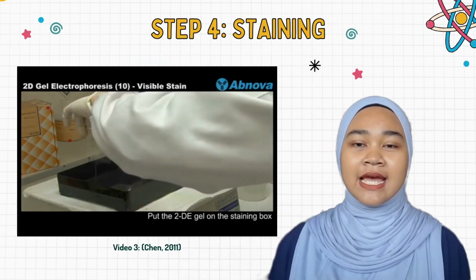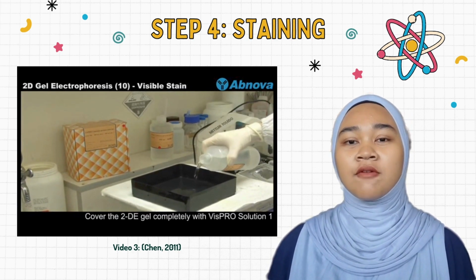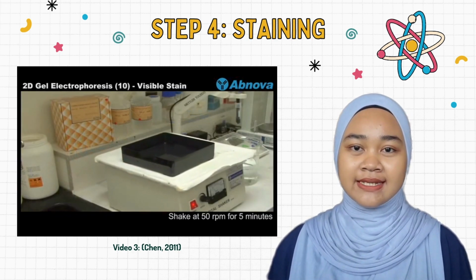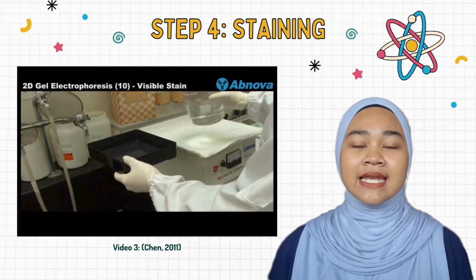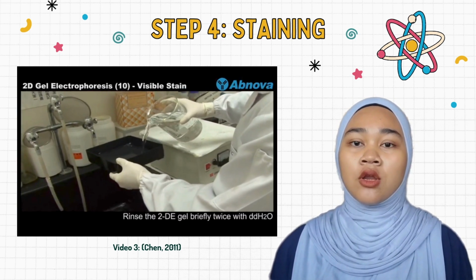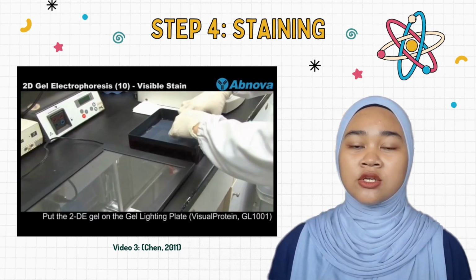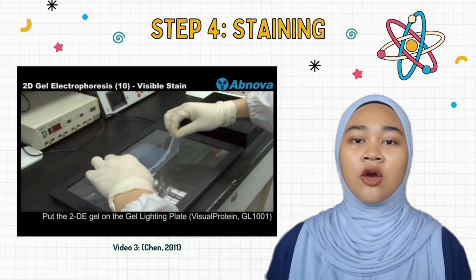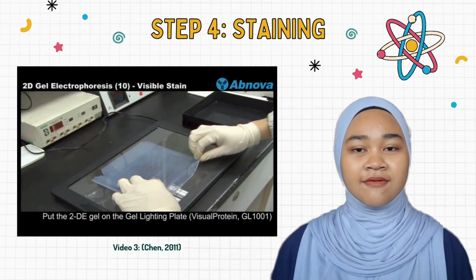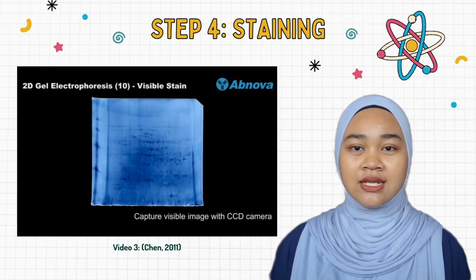The fourth step is staining. There are 2 purposes of staining, which are visualization and comparison. As per biorad.com 2025, staining is vital because it makes the molecules visible in the gel, allowing their migration to be monitored and documented. After that, staining allows direct comparisons, such as identifying and also determining variations in protein expression.